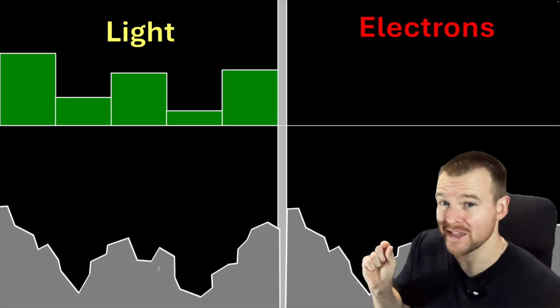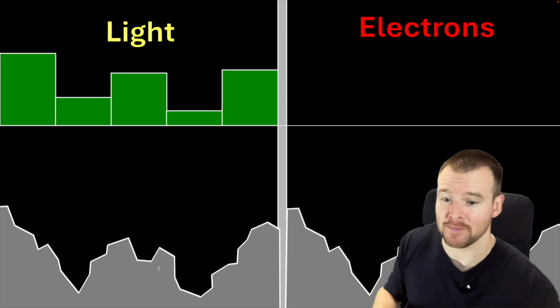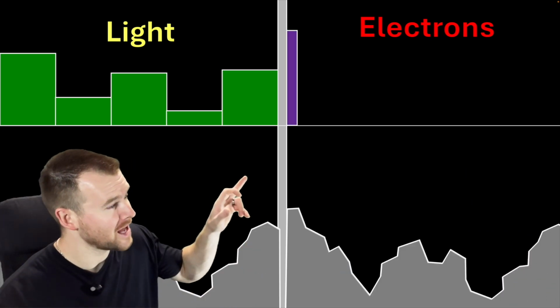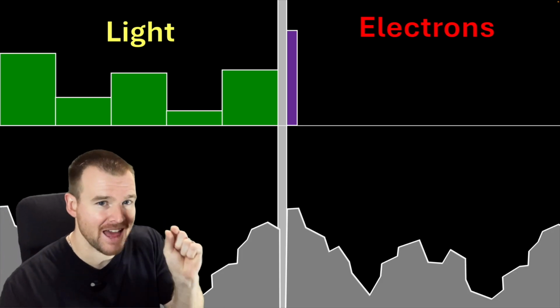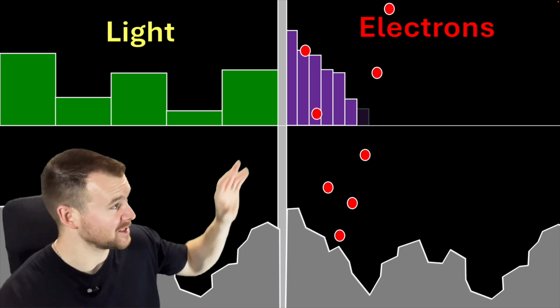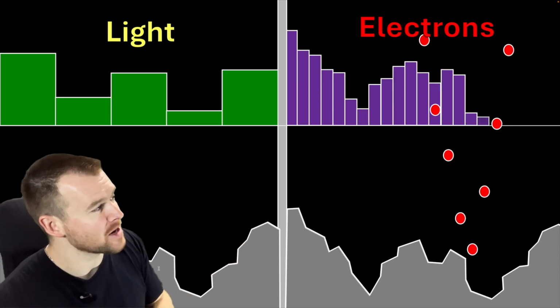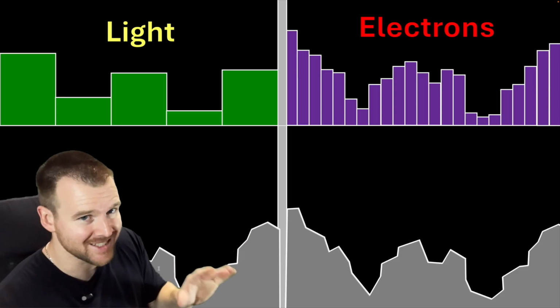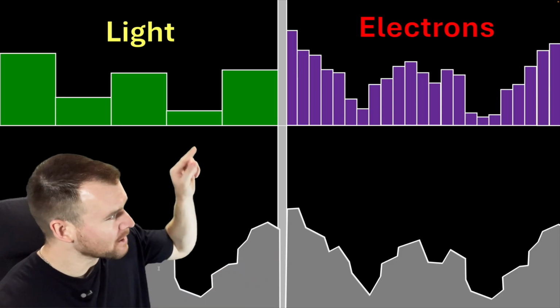What we're going to do is take something smaller like an electron. That's going to happen over here. I shoot something smaller. It comes down, bounces off, and I get my information about that location a little bit better. I shoot a whole bunch of these little things. We can see it's going down and giving us information. Because the electrons are smaller, the purple lines, they're still not quite exactly like the gray one below, but it's a lot more detailed.